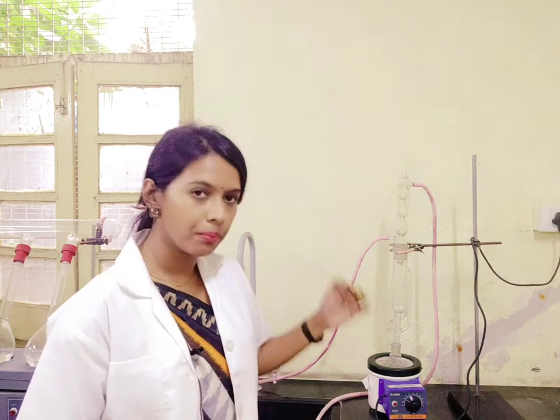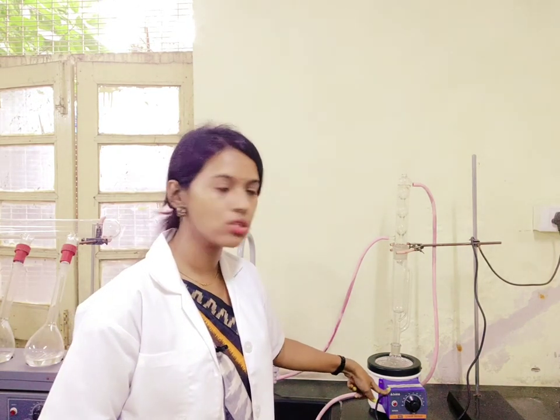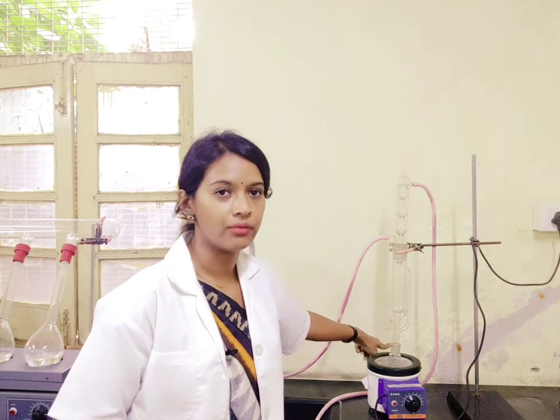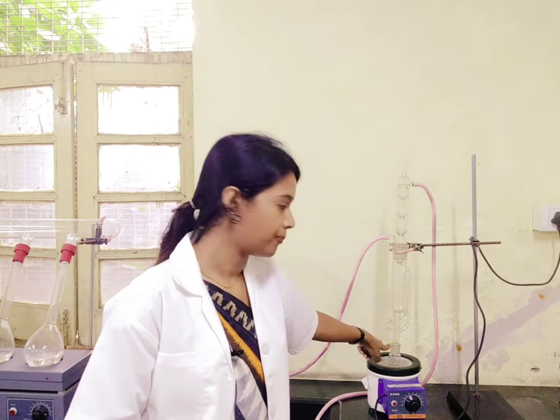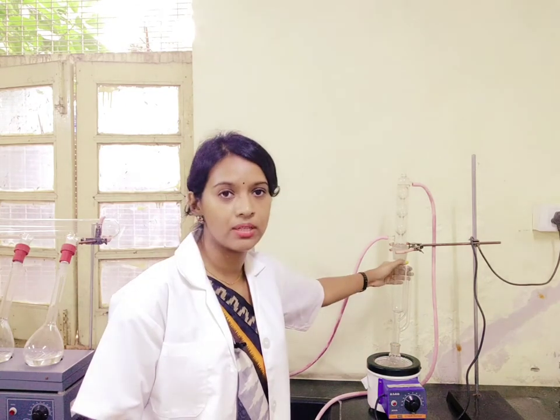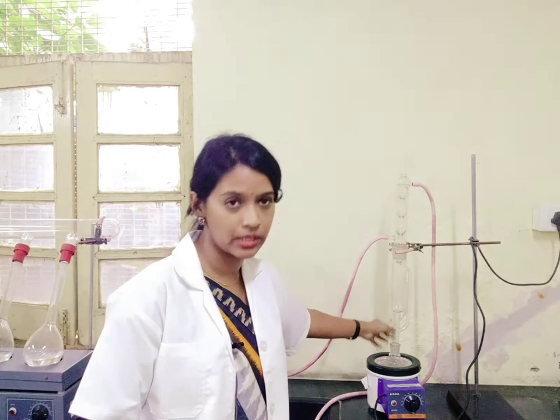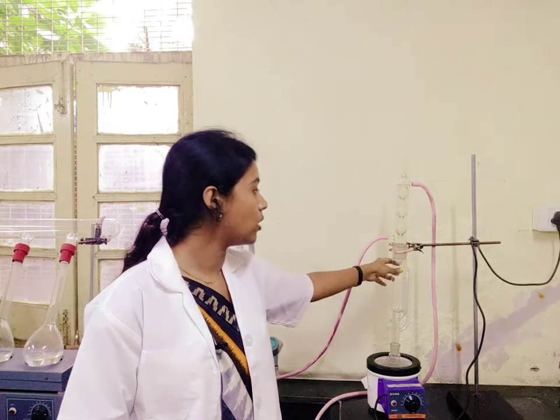If you look at the different parts of this instrument, first you have this heating mantle on which a solvent flask is kept. This is a flask in which we will mostly place the solvent, so that we can extract the fat. On top of this solvent flask, one Soxhlet chamber is placed — this entire part is called the Soxhlet chamber, where you have to keep the sample.